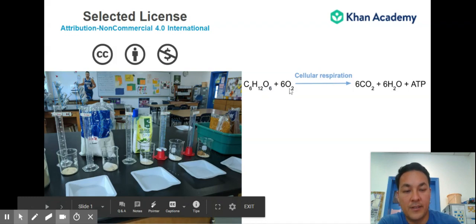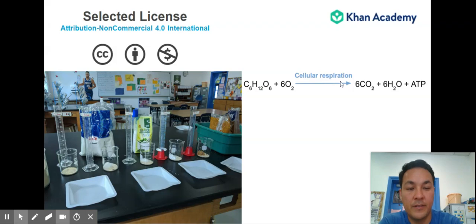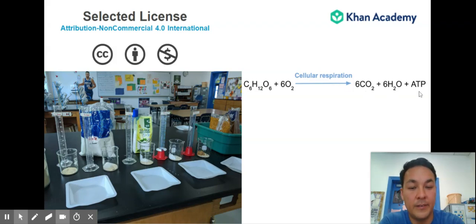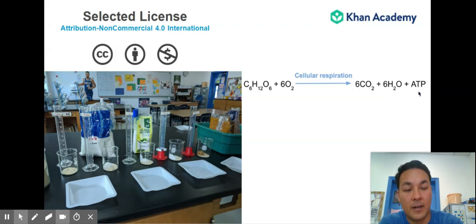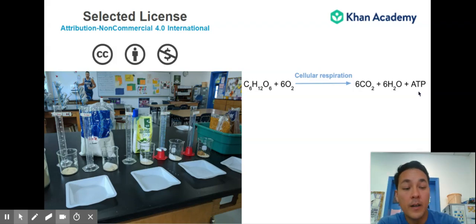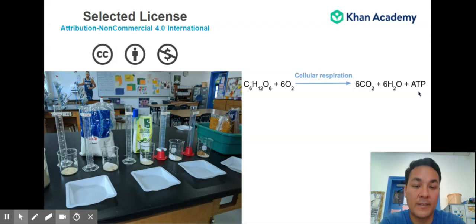In the presence of oxygen, the yeast are going to do cellular respiration. They're going to produce carbon dioxide, water, and ATP that they can use. That carbon dioxide is going to be given off as foam that we can see rising up in the beaker — you would just breathe it out. Notice how the equation for cellular respiration is the opposite of the equation for photosynthesis — they're a never-ending cycle.